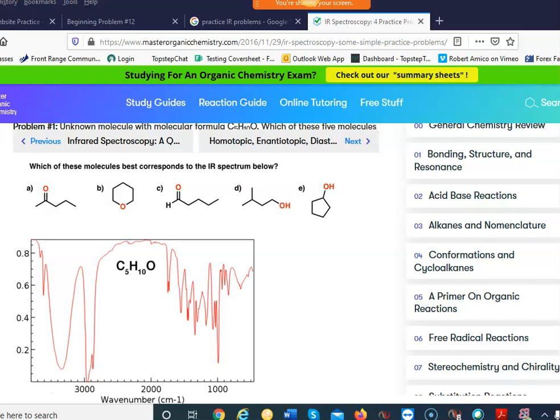Okay, so he sees an alcohol. Yeah, immediately, very characteristic alcohol. Amy says aliphatic. Yep, very good, Amy. Definitely aliphatic. So the alcohol peak is this big round peak right there. And then aliphatic, here's 3,000. You can see just to the right of 3,000. I mean, you can draw that line right up there. So aliphatic and an alcohol.